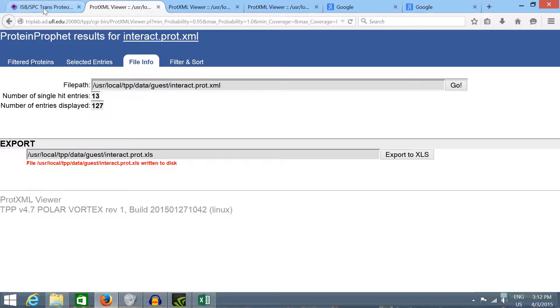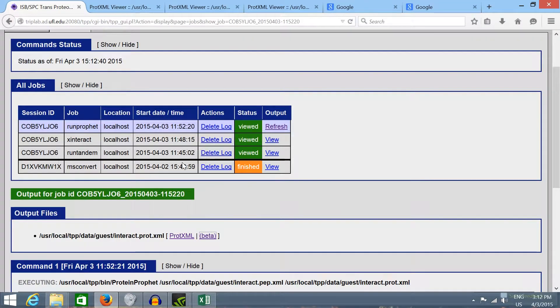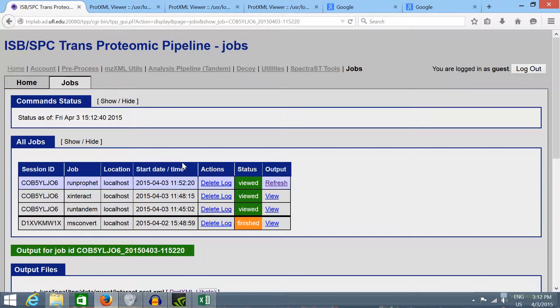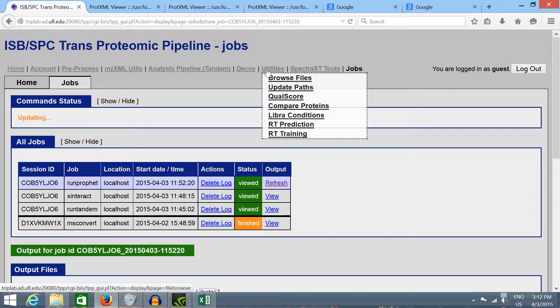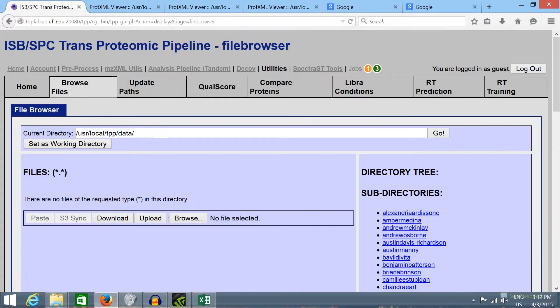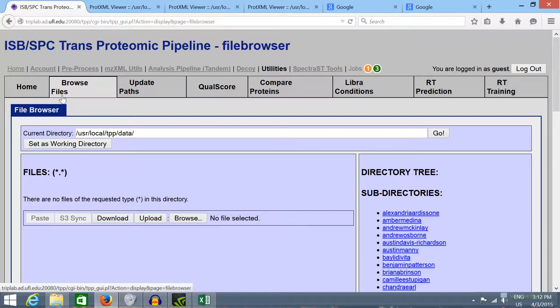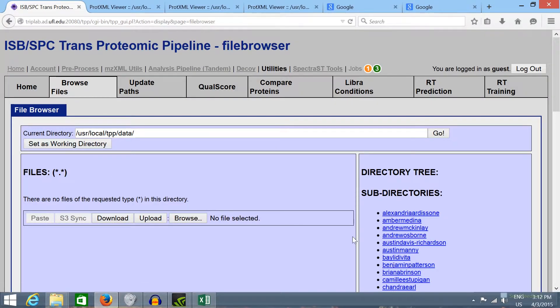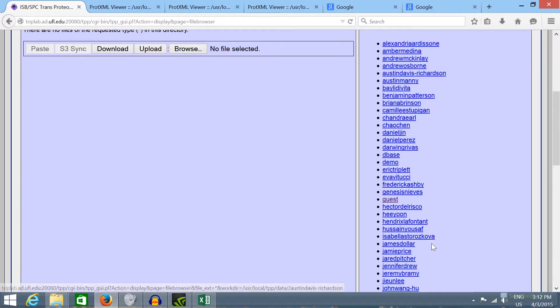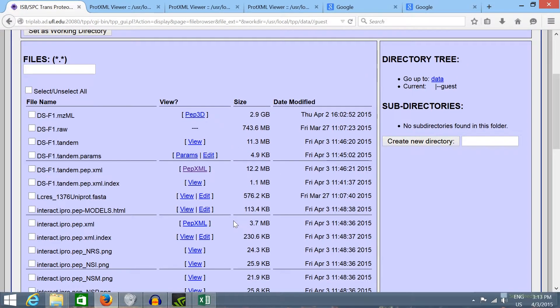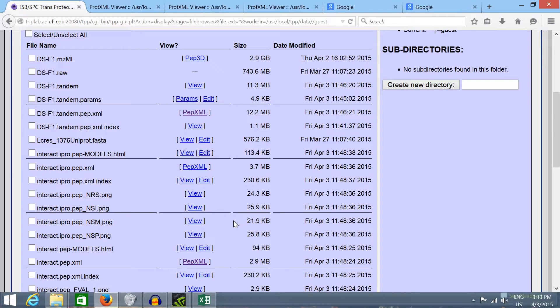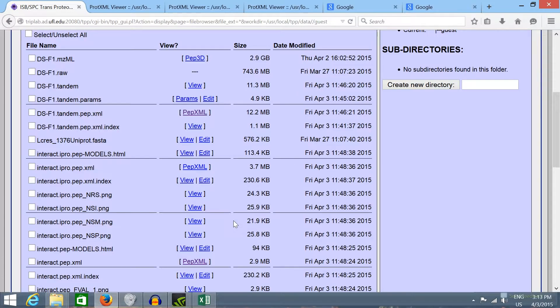We can use the file browser utility to download this exported Excel file. I'm going to click in utilities browse files. Here you have to select your user name. And I'm going to select the interact.prot.xls file.